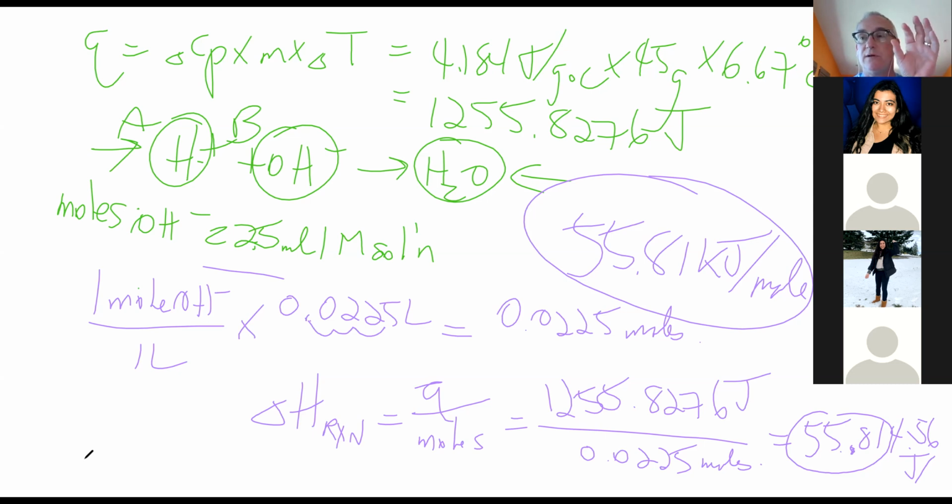Just remember, when you do the second reaction, I think it's important to have less than 1 gram, because when you add the 50 mils of the dilute HCl, if there's any more than 1 gram in there, it won't neutralize all of it. So if you're assuming that all of it gets neutralized, it won't.